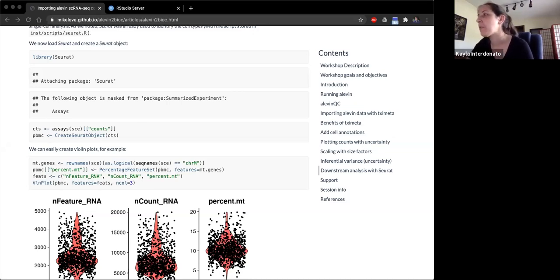What is the approach to using Alevin with single nucleus data? With CellRanger, it's recommended to use a pre-mRNA reference by using a GTF, where feature type transcript is extracted and replaced by exon. Any particular recommendation for the Alevin-Salmon index process?